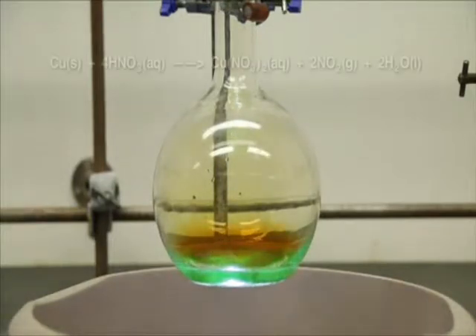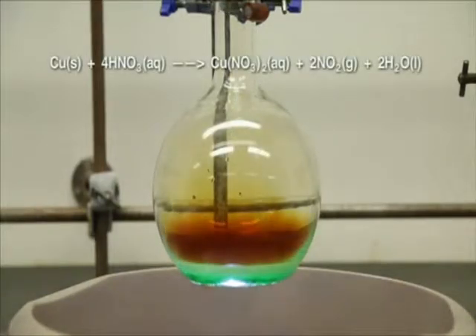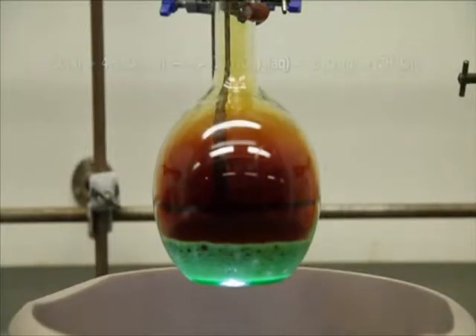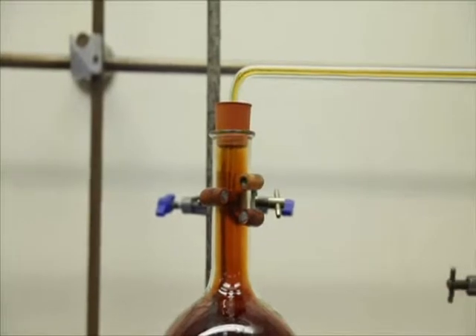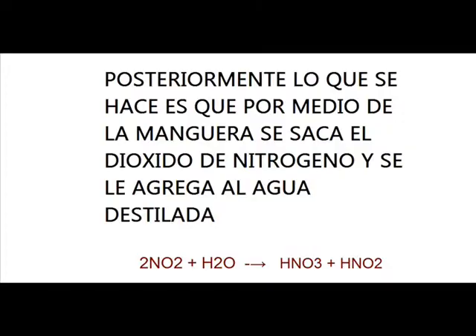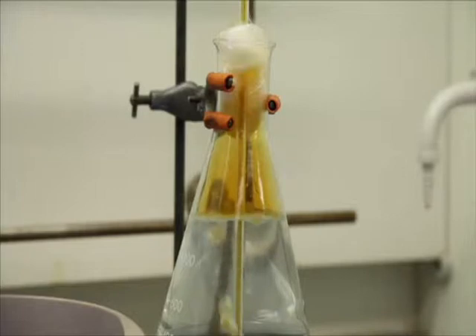Immediately we begin to form NO2 gas above the copper nitrate that's formed. There's a delivery tube here feeding into a 1 litre flask of water. The glass wall is there to minimise diffusion of any toxic NO2 that doesn't dissolve, and as such you can perform this experiment without use of the fume cupboard.